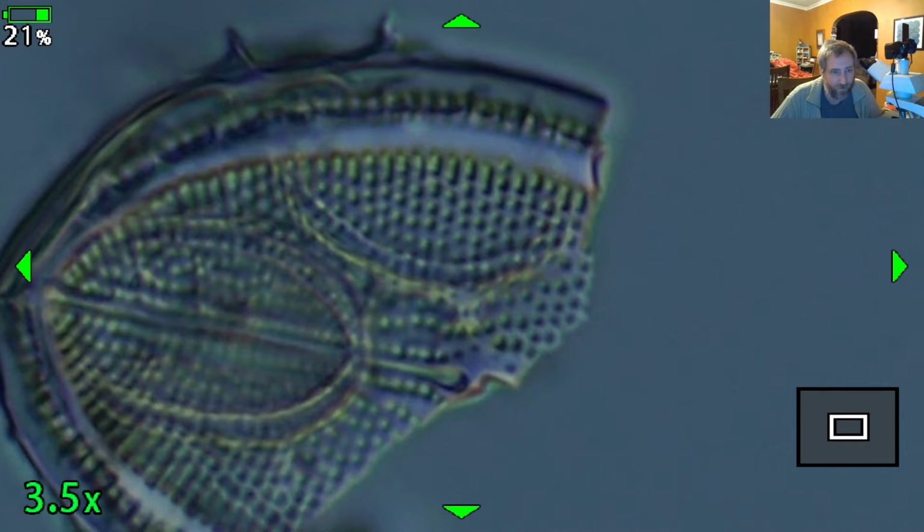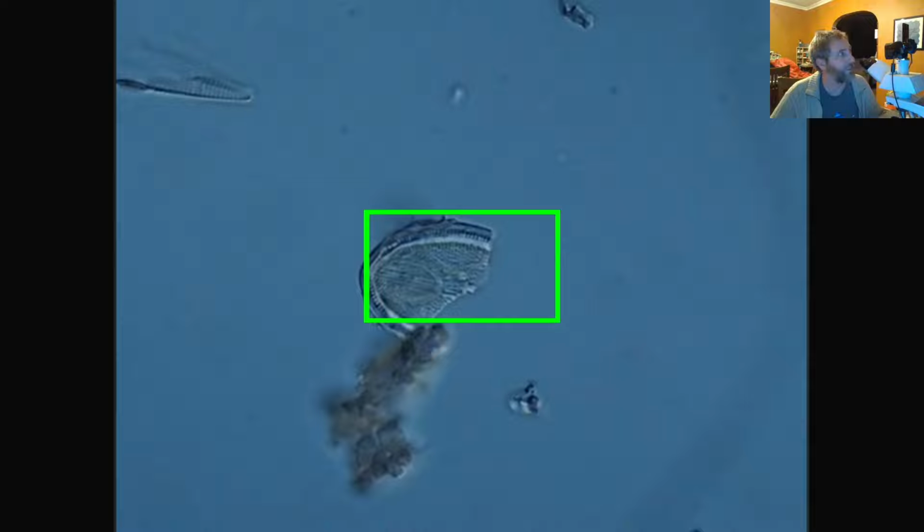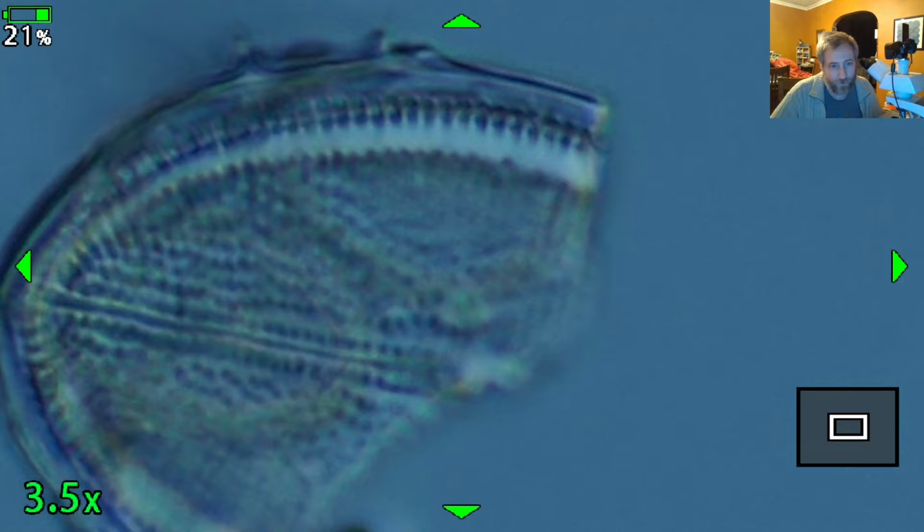So this is actually kind of an interesting view. We're zoomed in super close. That's a Cocconeis, which is the monoraphid diatom that we saw before. That's the raphid valve, but it's fragmented. So normally you'd see a whole oval, and now we don't see the whole oval.